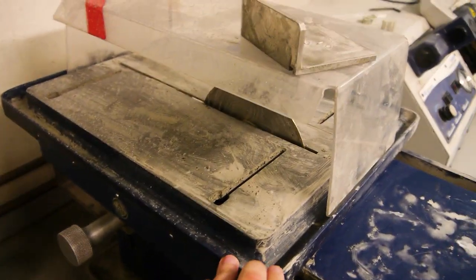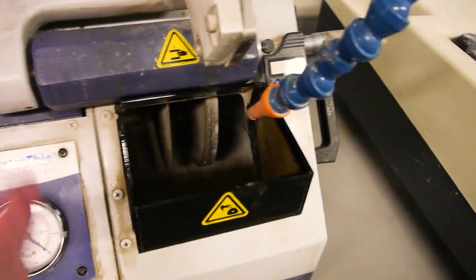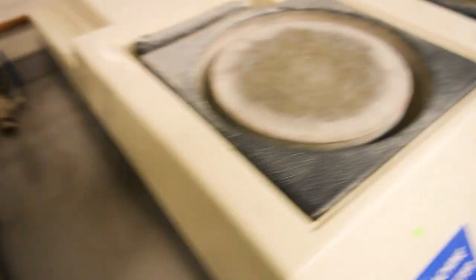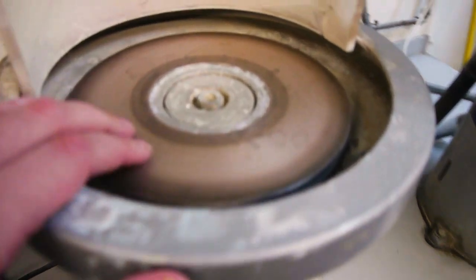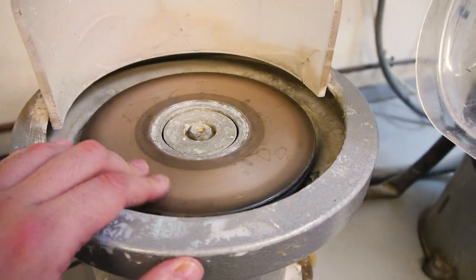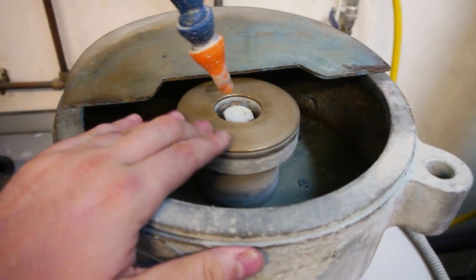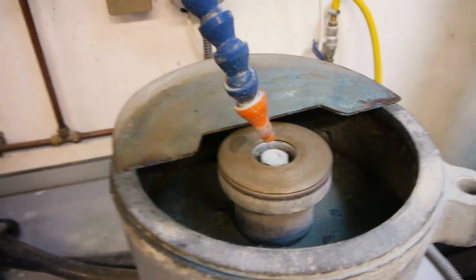Another kind of saw — this is usually where Roger's chopping up his fossils. This machine in there, we use these grinding wheels as we're grinding down the thin sections. Stick the thin sections on here with a vacuum. This is another set of polishing wheels — lapping wheels really — for polishing down samples. These are some really coarse polishing wheels, these copper and aluminium studded wheels. We use these for getting samples nice and flat, so they can either be polished or glued onto glass slides for making thin sections.